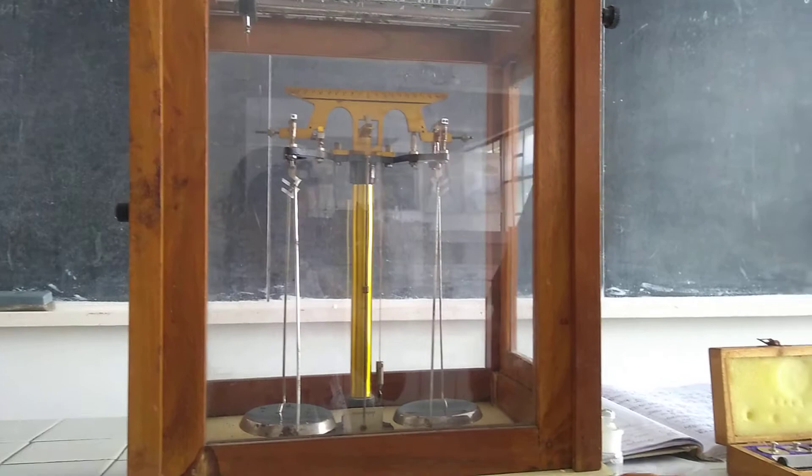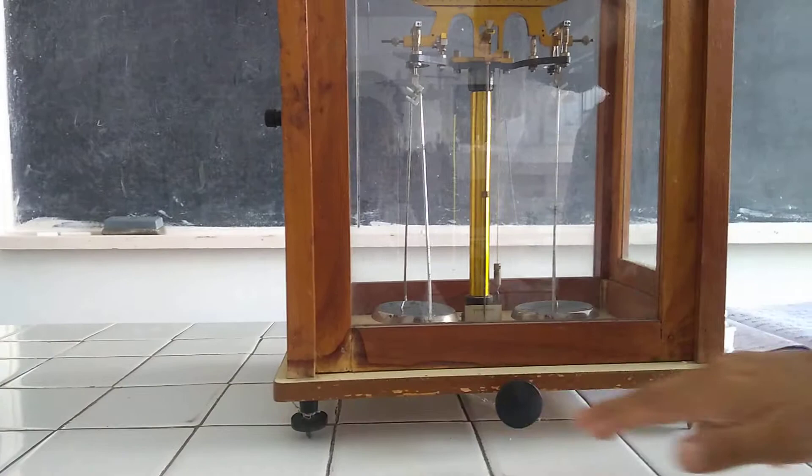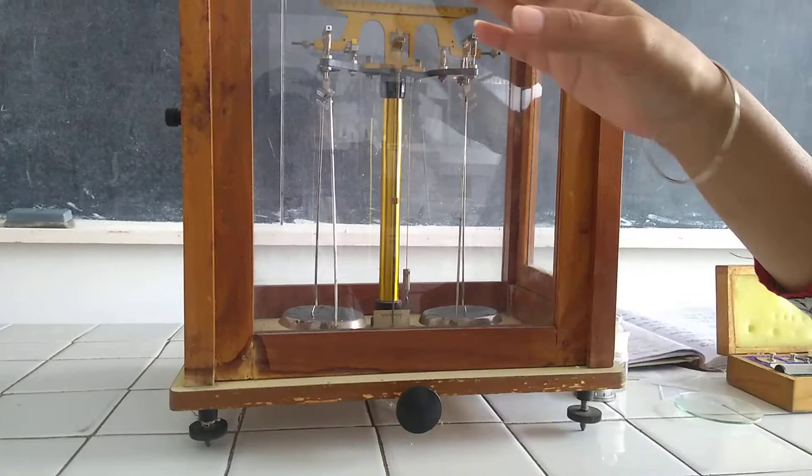The third part is the leveling screws — these black portions. These are the leveling screws. Basically, these are used to balance the analytical balance.